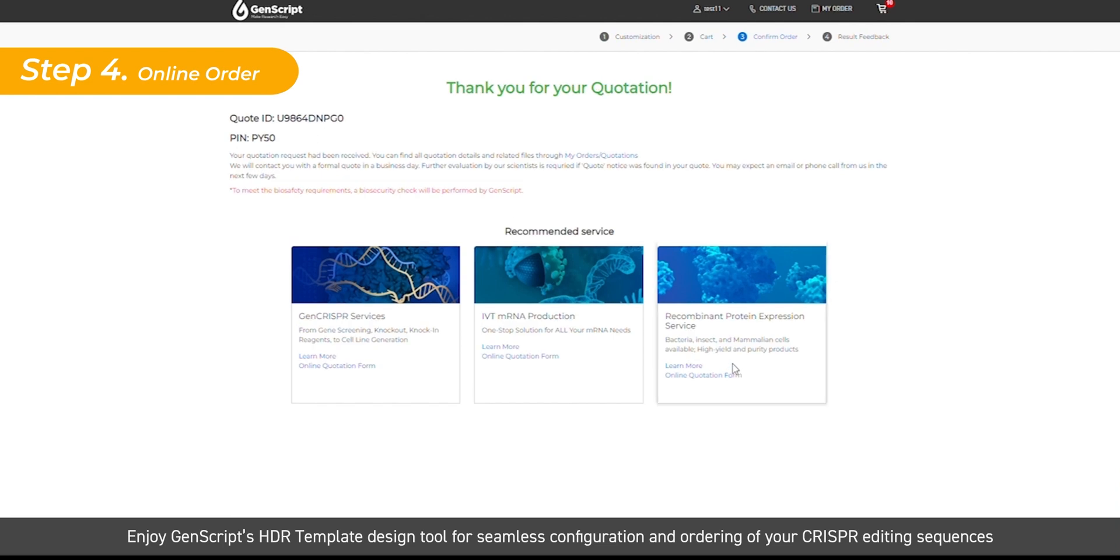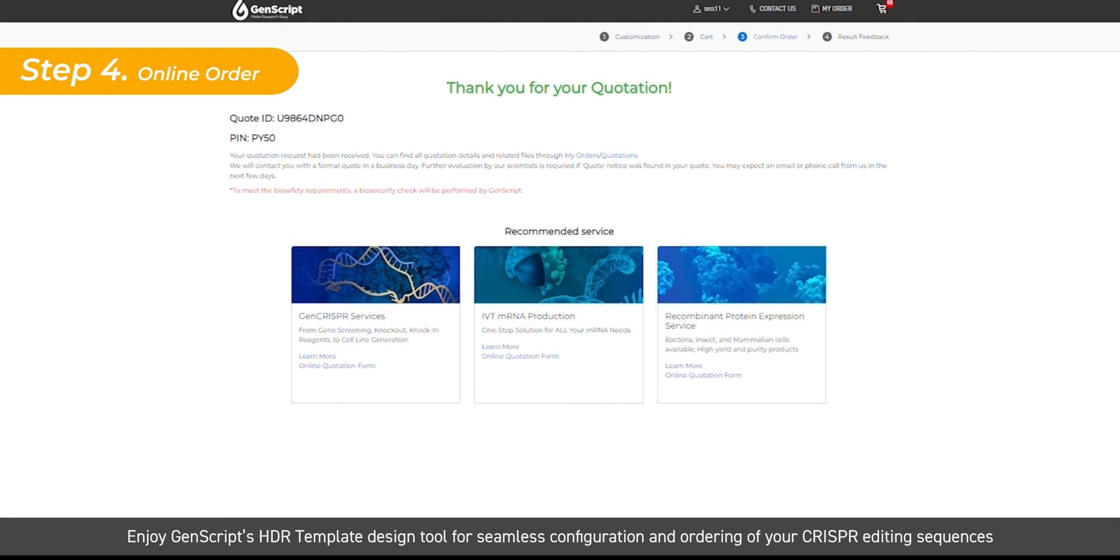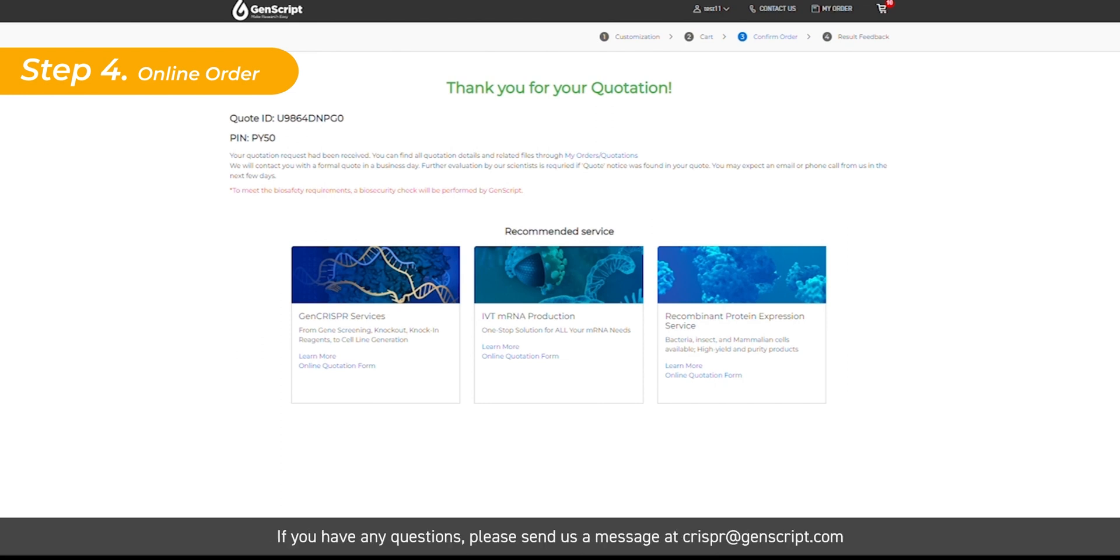Enjoy GenScript's HDR template design tool for seamless configuration and ordering of your CRISPR editing sequences. If you have any questions, please send us a message at crispr@genscript.com.